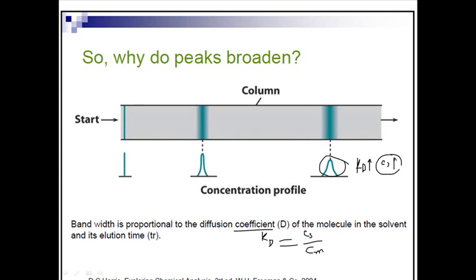So the more the analyte molecule chooses to attach to the stationary phase molecule, the later it will elute, right? Because it has a tendency to attach to the stationary phase molecule while the mobile phase is passing out, so it has a tendency to elute last. In those pictures, we can find the bands at the last position.